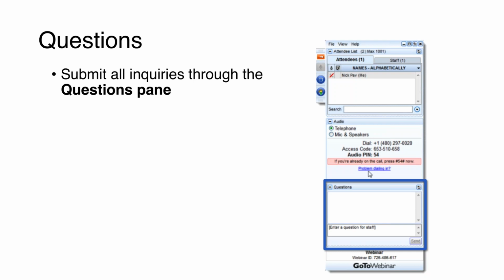It's a fairly complicated question, but I think it'll become clear as I read it out. The default for the K2 is that the dose fractions will be saved locally on the K2 PC. Did TSRI develop their own script for moving the buffer to the buffer server? And if so, could you explain the logic behind that script?